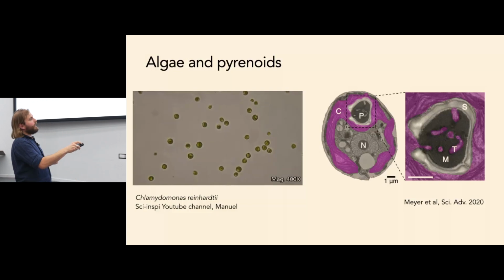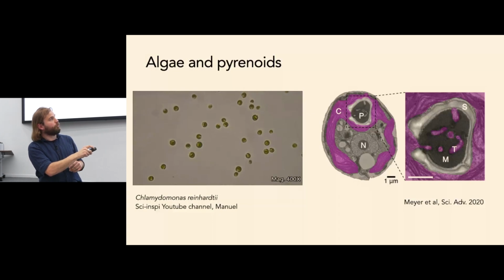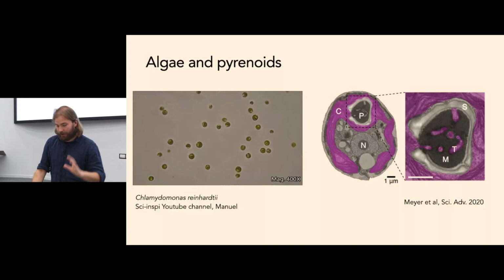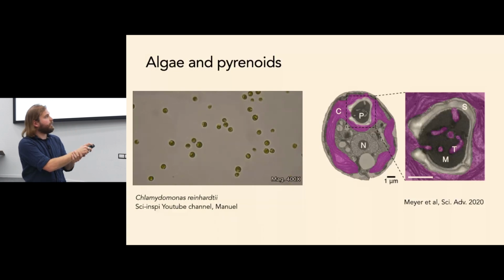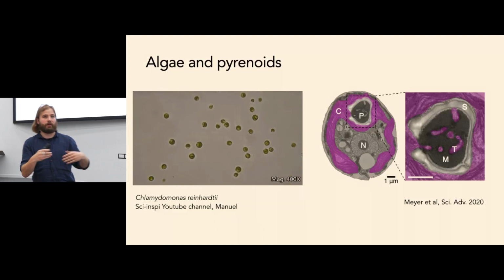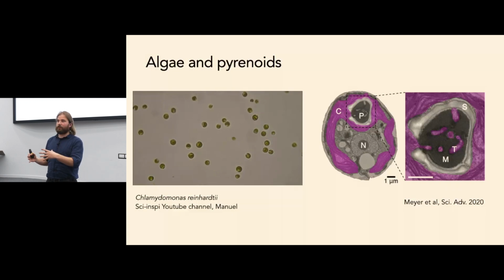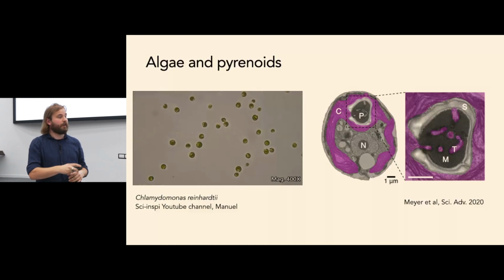But if you put an algae like this into an electron microscope, you can see this bit of the algae labeled P, which is the pyrenoid. So the pyrenoid gets around the problems with fixing carbon dioxide by firstly having an enclosed space that the organism just pumps carbon dioxide into. And that gets around the thermodynamic difficulty of the reaction, because by putting in lots of carbon dioxide, you push the reaction over to the other side.